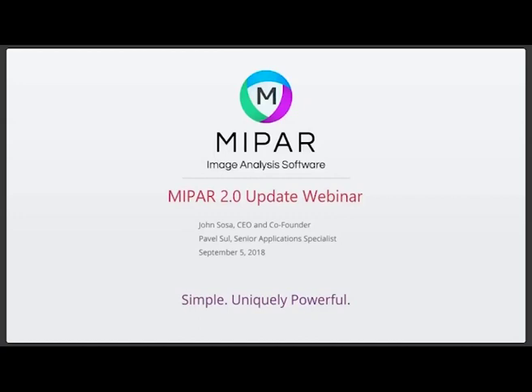And what we're going to be showing you today are not only a demonstration of some of the new features that are in our largest release today, 2.0, things like simple recipe mode, a recent recipe library, and more consolidated reporting. But more importantly, we're going to be showing you those features in the frame of two exciting case studies that we have partnered with collaborators on that have not only saved our partners enormous amounts of time, but let them reach realms in their image analysis that they were previously unable to.